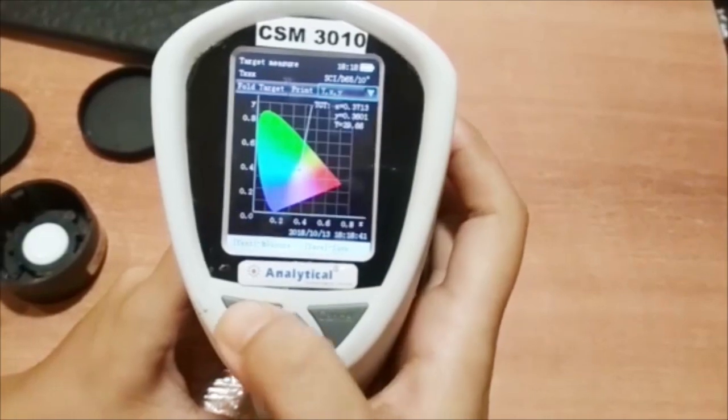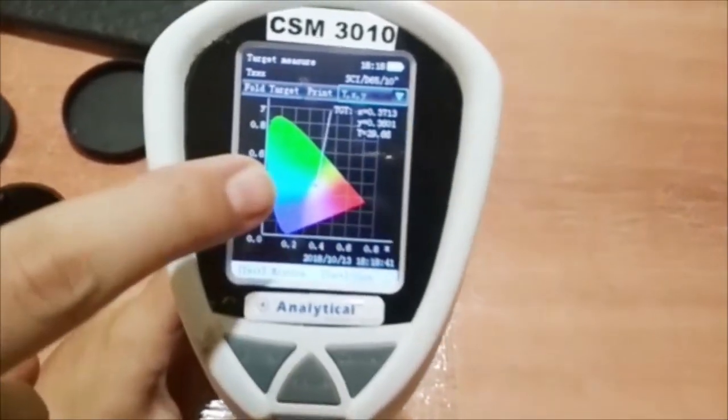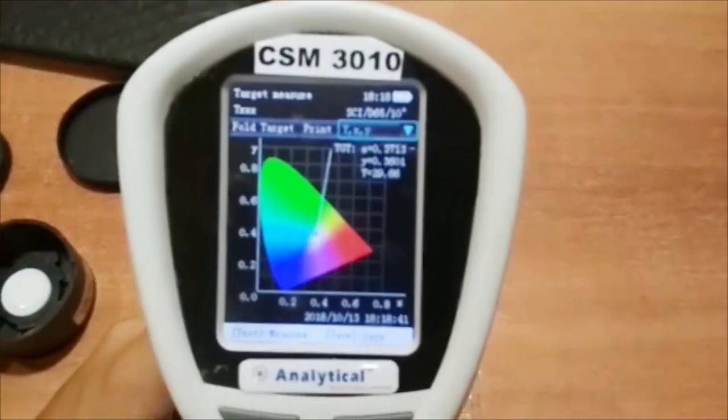We can get different parameters shown on the bar. Save the measured data — this is the profile for the white colored polythene.